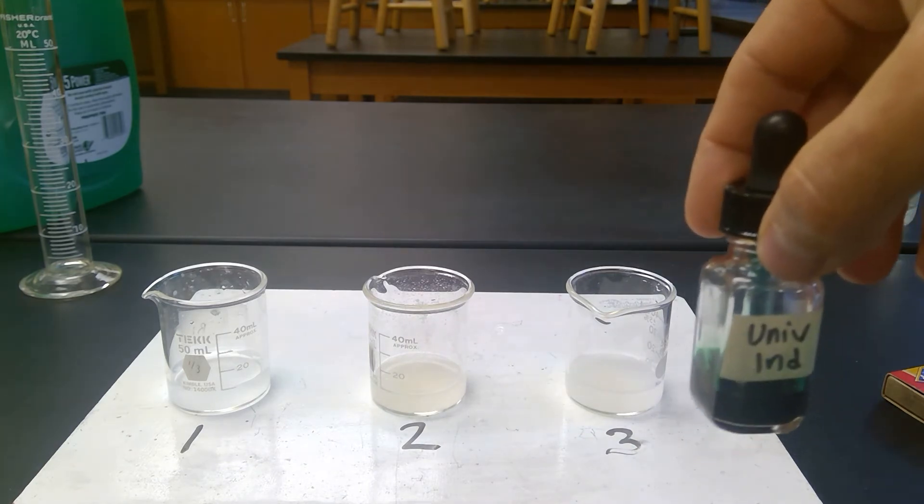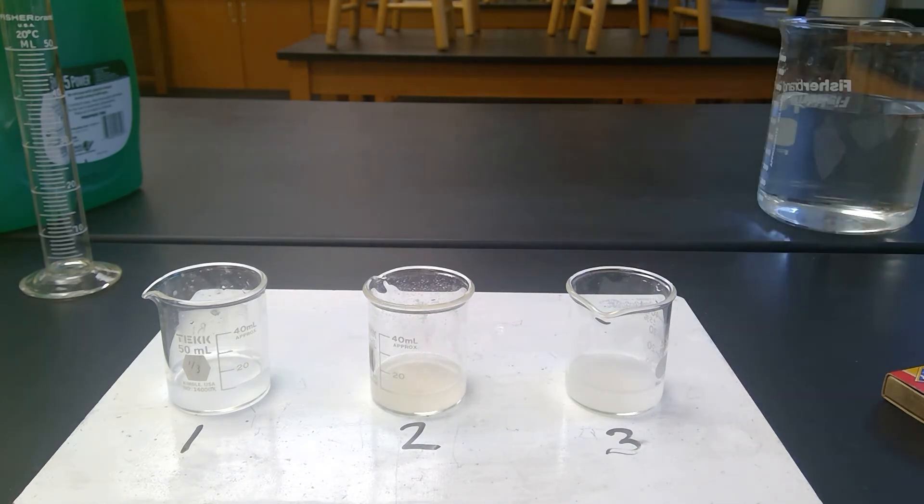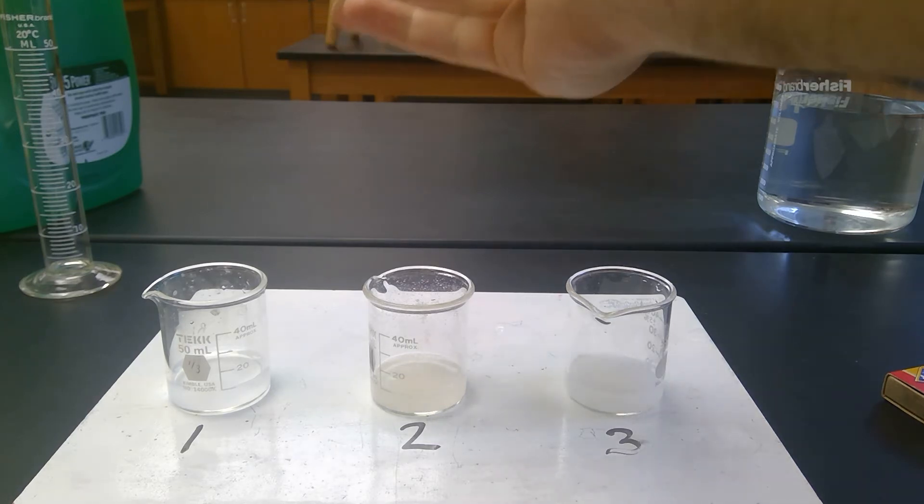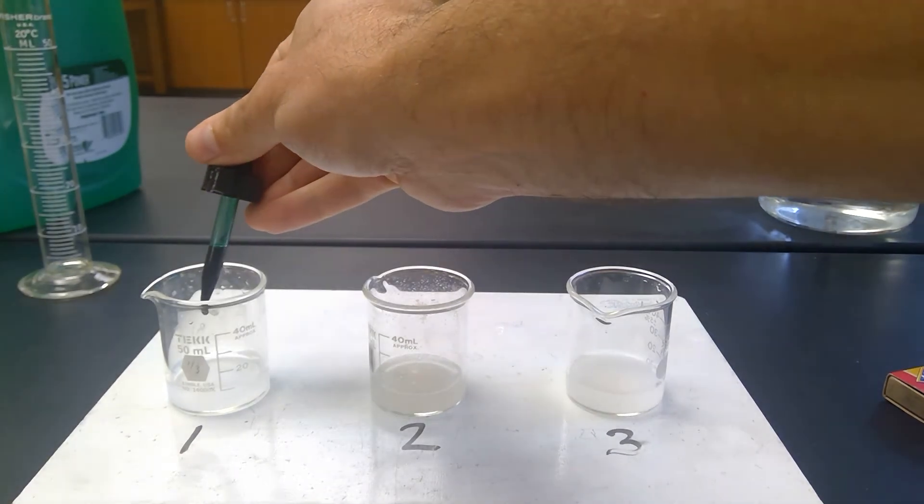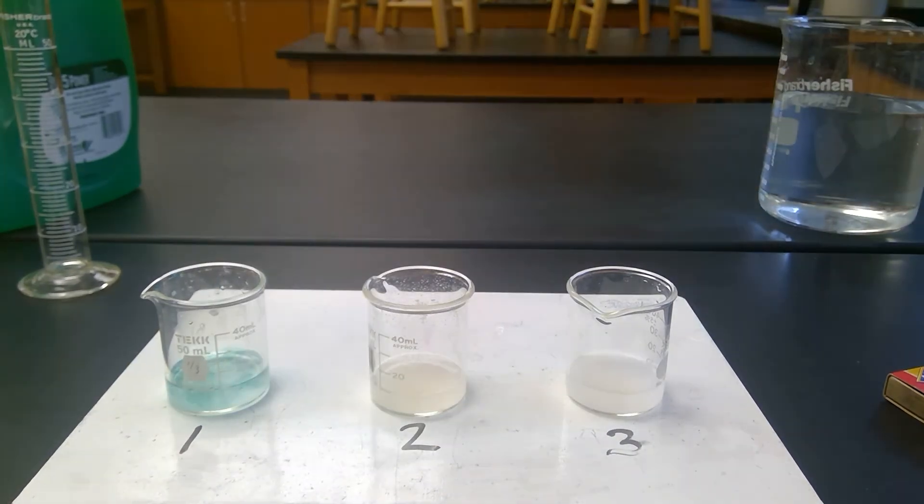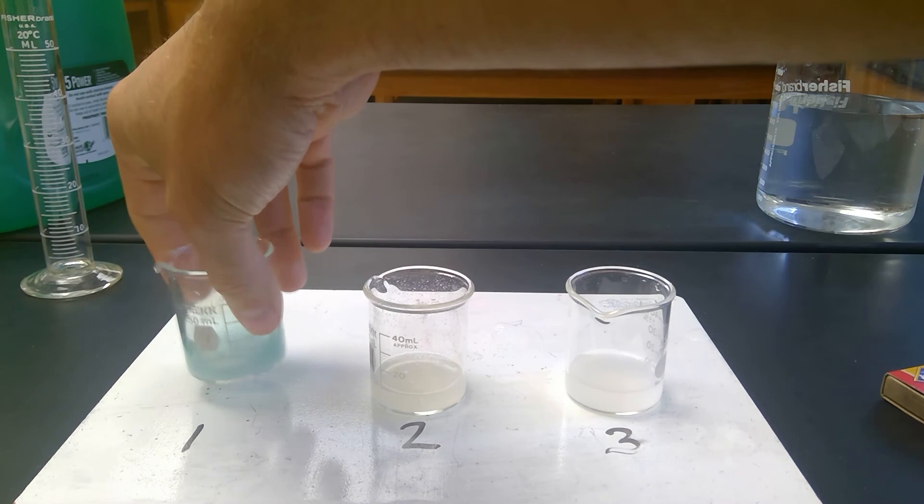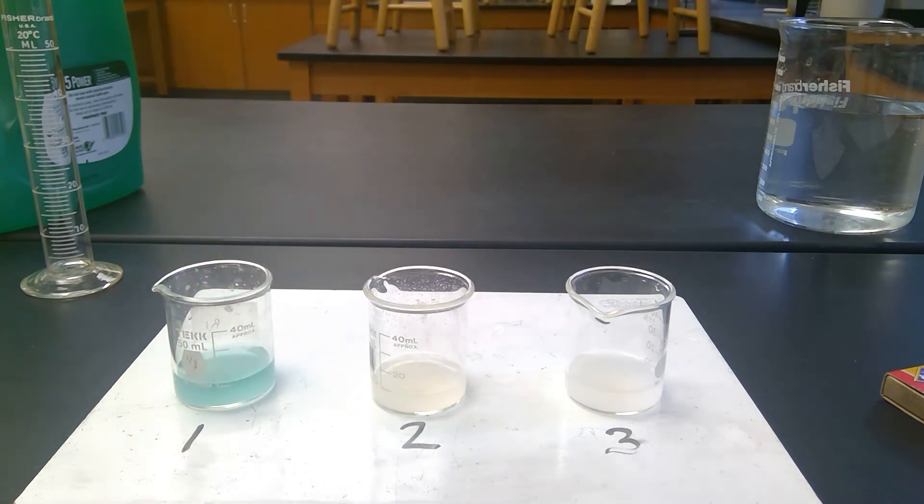So now I'm going to add this stuff called universal indicator, and this is going to determine the pH. So I'm going to add two drops to number one. Swirl that around and you see it's kind of a blue green color.